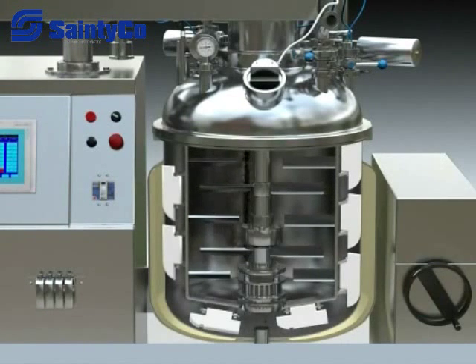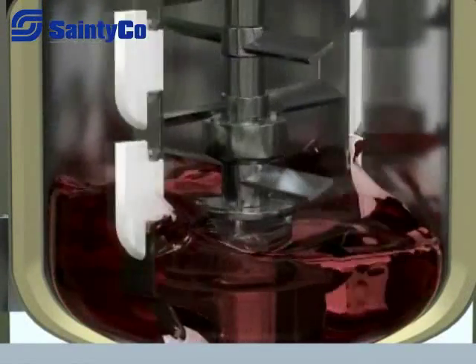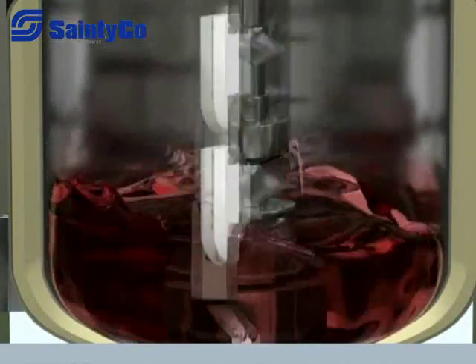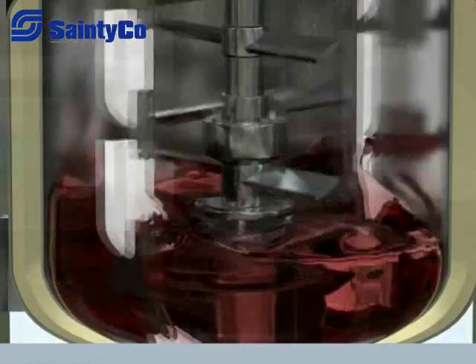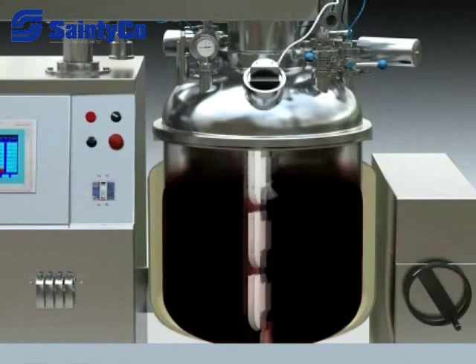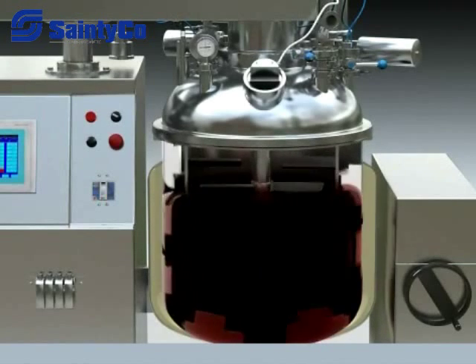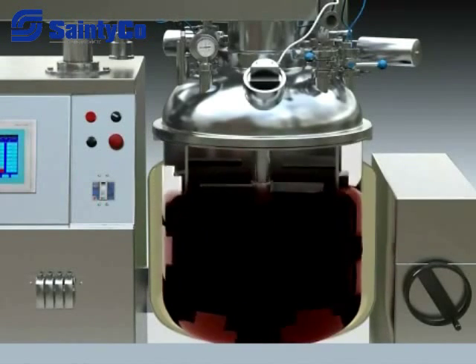When loading material to the tank, the low-speed mixer starts mixing the material in forward and reverse directions. The forward blade makes the material move up and the reverse blade makes the material move down. At the same time, the scraper blade scratches material that sticks to the tank wall. Materials are loaded into the emulsifier from the top and bottom of the tank and are pushed out in the middle by centrifugal force, then cut into very small granules under the effect of the emulsifier head and emulsifier cover.